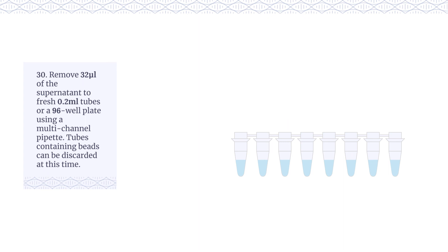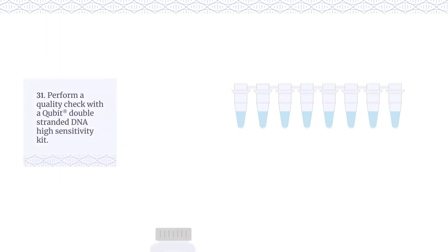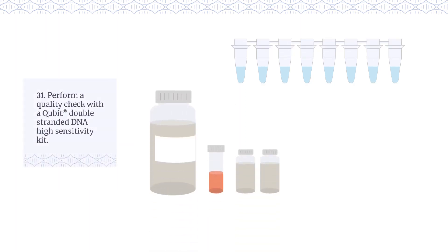Tubes containing beads can be discarded at this time. Perform a quality check with a Qubit double-stranded DNA high-sensitivity kit.